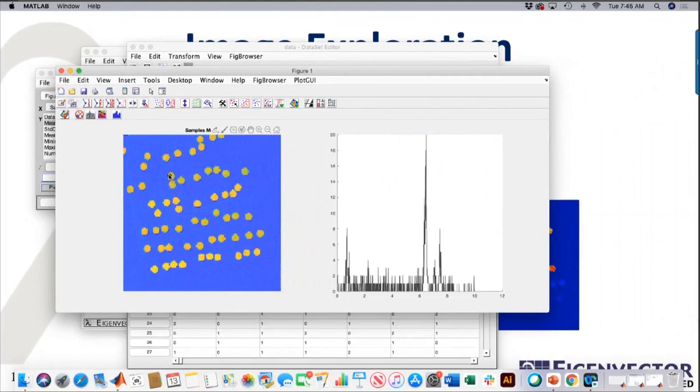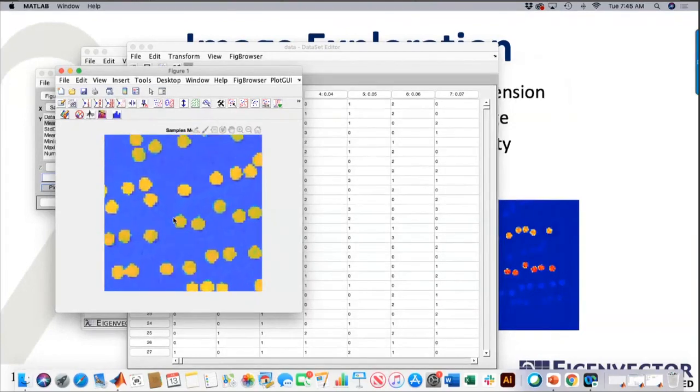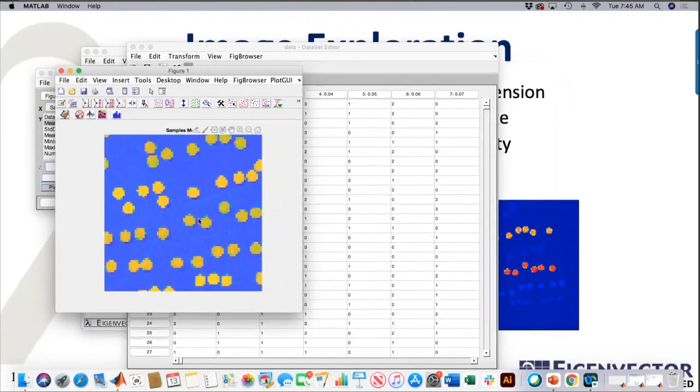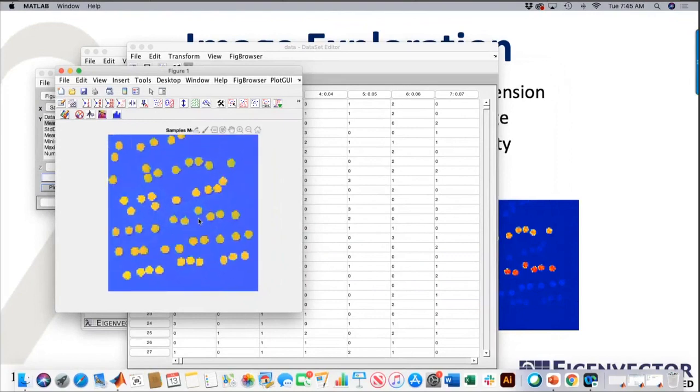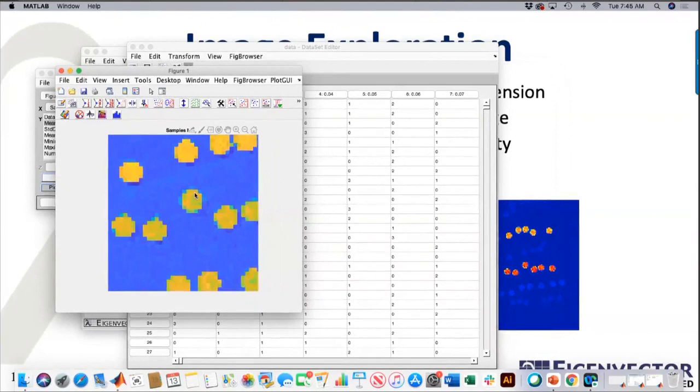And so that's the tool there. And then also anytime, I'll turn that back off. You know, you can always zoom in on these. It used to be that you had to use this or one of the tools in the toolbar to zoom. MATLAB has enabled pretty much zooming from just using your mouse nowadays. So that's kind of been obsoleted.